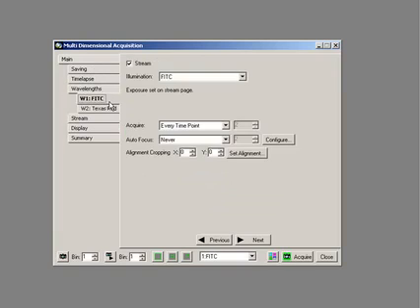If we now go to wavelength, we see that we no longer have an exposure time available, and that's what I mentioned earlier. The speed acquisition has taken the fact that we've switched the camera into a mode where we're using the exposure time of the camera to set our rate of speed.